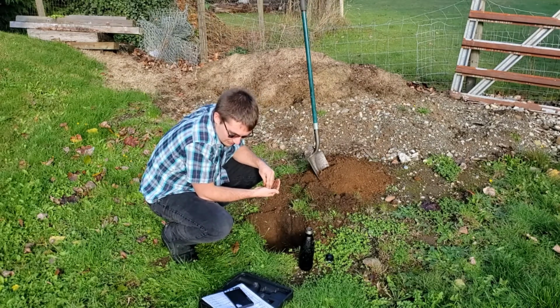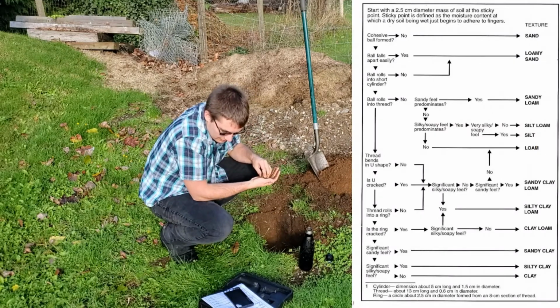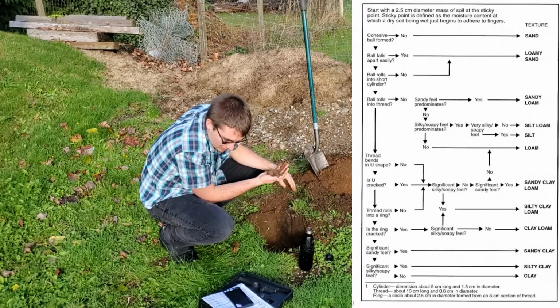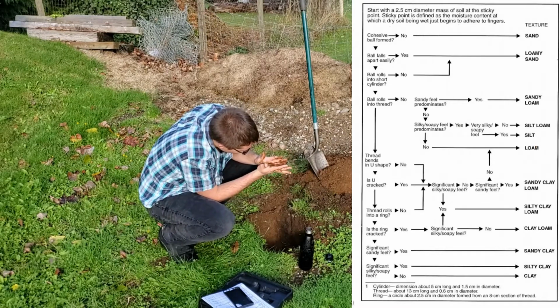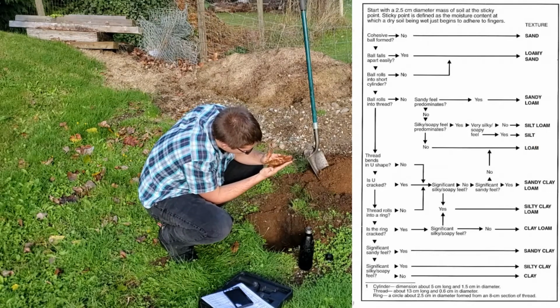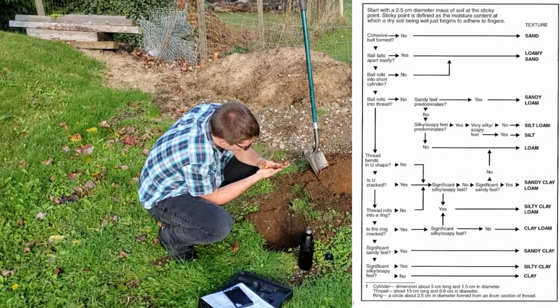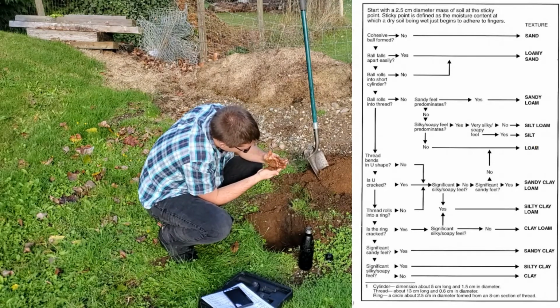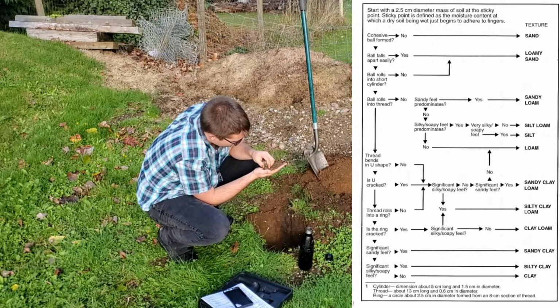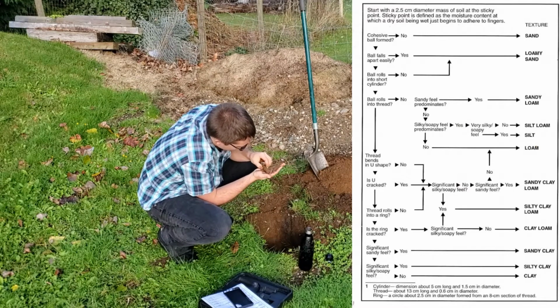So a cohesive ball has formed. Yes. So does this ball fall apart easily? Not really. So now we need to roll it into a cylinder, which it's kind of doing. Might have a little too much water, but that's okay. So it is rolled into a short cylinder.